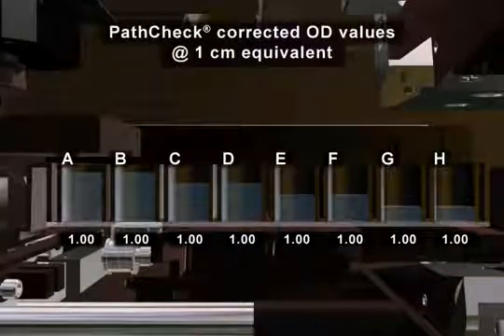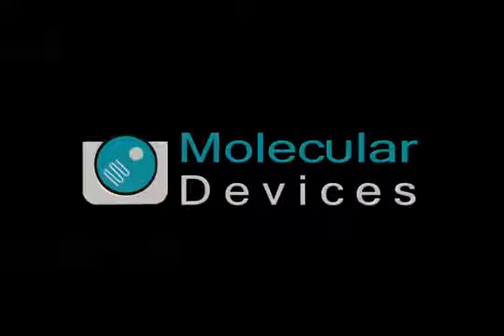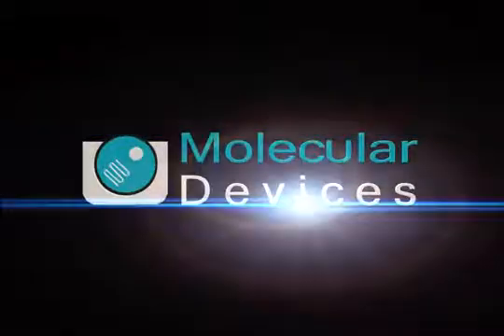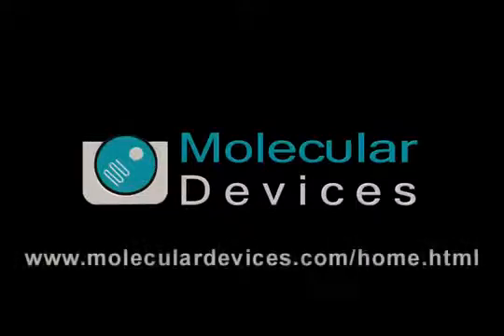These unique features, along with luminescence, TR-FRET, and HTRF capabilities, make SpectraMax an indispensable tool for the lab. Please contact your Molecular Devices representative for additional information.